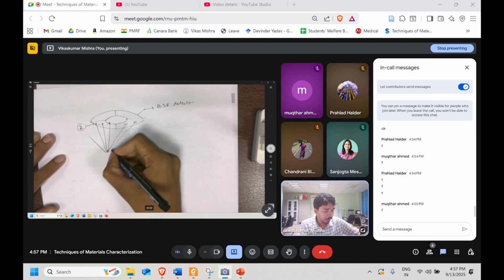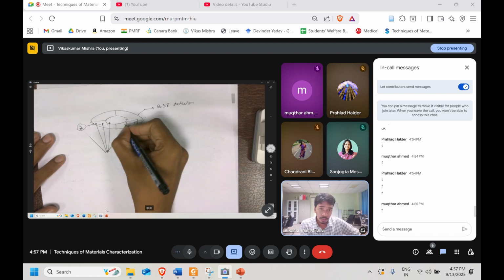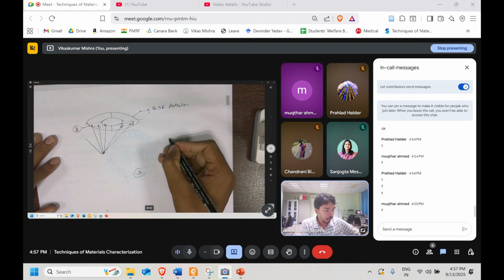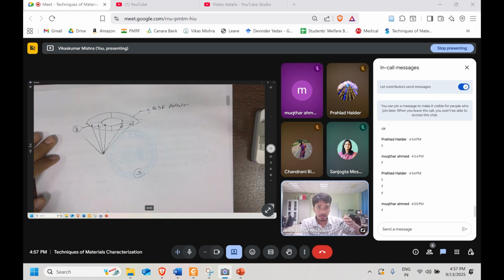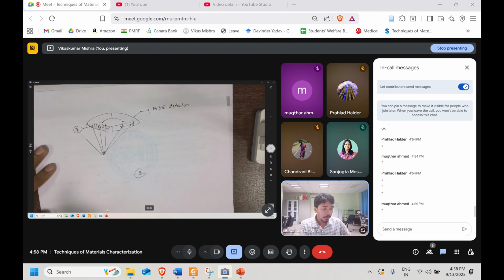But for another section, the same thing which is bright over here will be darker in this case because it got scattered. So the shadow which has been created over here has to do with the directionality. Due to that particular cavity or edge, the backscatter electrons have scattered in a different direction, which is not detected by this detector. It might be detected in another detector.